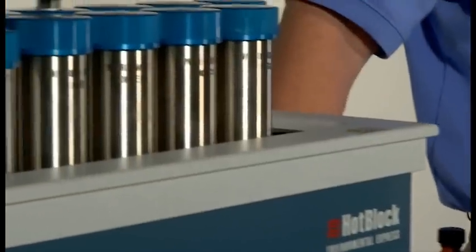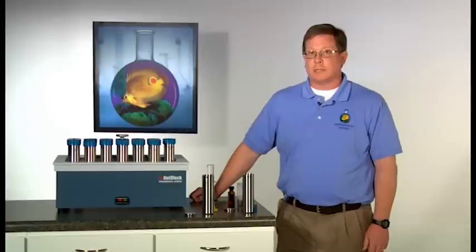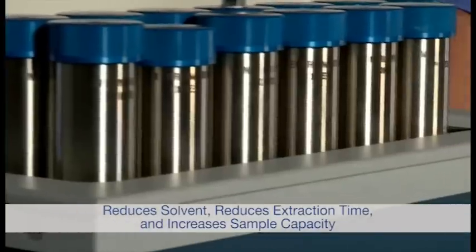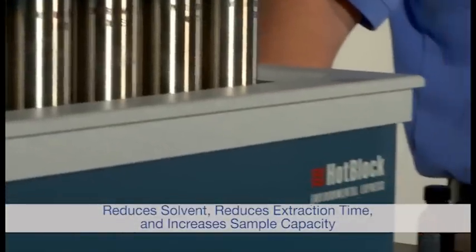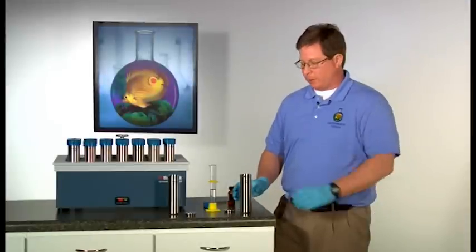Method 3546 has several advantages over more traditional extraction techniques such as Soxhlet and Sonication. It requires far less solvent, reduces the overall amount of extraction time, and allows one to extract up to 35 samples at once. The first step is to weigh 10 to 30 grams of sample into the soil extraction cell.